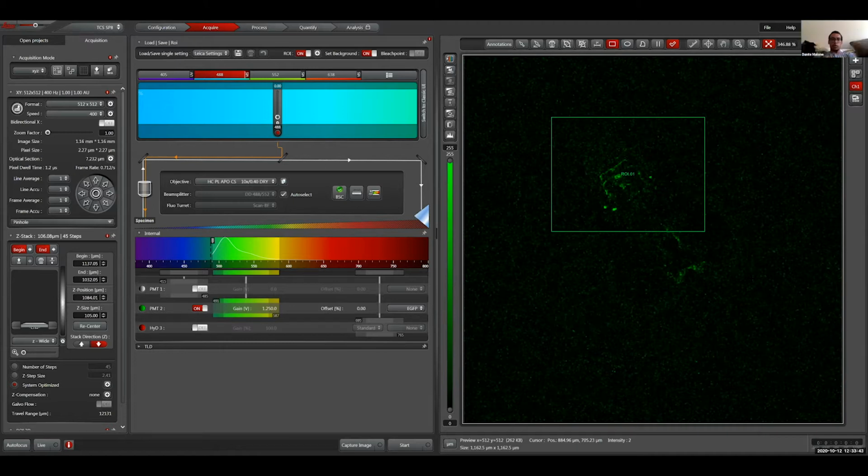So it'll all just be black? Hopefully. Okay. Yes. Hopefully. And then, but inside it uses laser power 4. Okay. All right, we're going to do the same. Now the gain is cranked up, which is why it's all grainy, but that's okay.